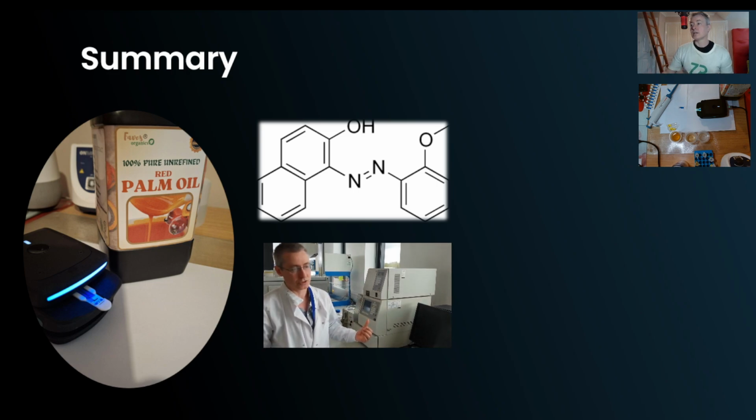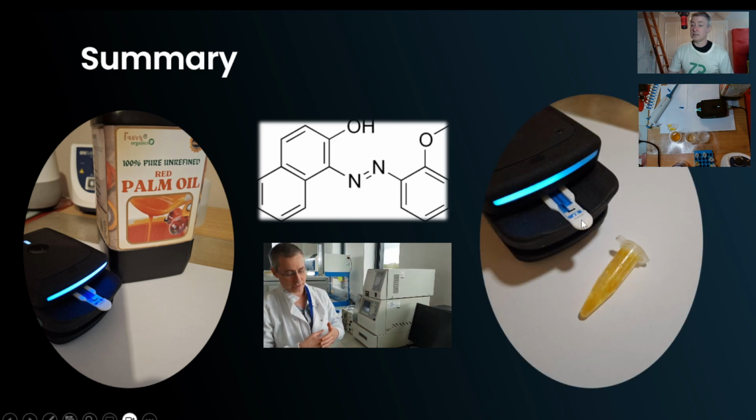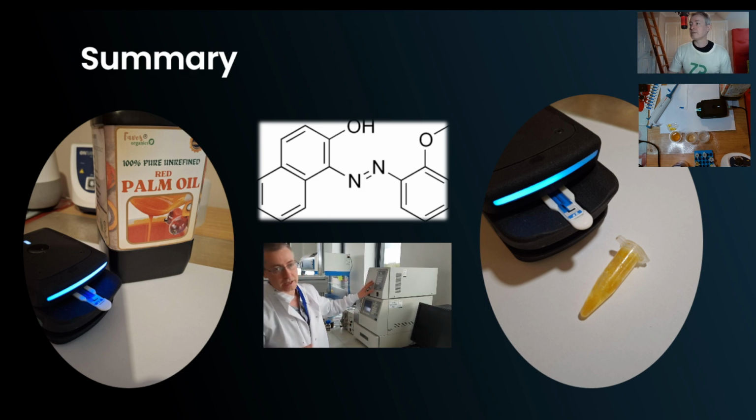In places like the US and Europe, you do need lower cost, simple to use instruments. So I put my hand on such an instrument here, and it was simple enough to prepare that sample, and you saw how quick the analysis can be. I did that analysis in probably about 15 seconds.